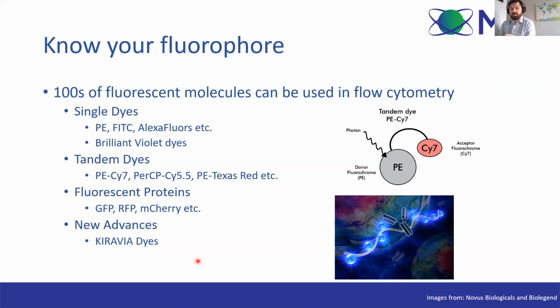As well as minimizing the quenching, as you can see here, it also allows more different fluorophore molecules to be tagged to the same antibody. So this allows a relatively dim fluorophore like FITC to actually be very bright because you're just multiplying the number of FITCs that you've got in there.